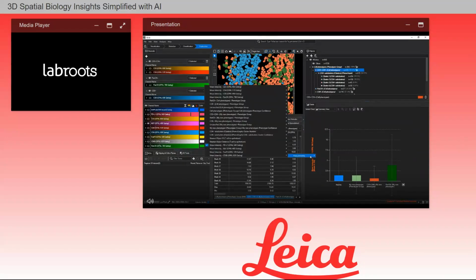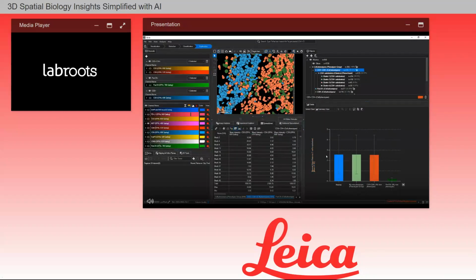We will now go to summary view in charts to look at the CD4 subcluster's relationship to PAN-CK. I am going to plot the mean nearest object distance, then turn off all the other object sets besides the 4 CD4 subclusters. The error bar is quite large on this image, so it doesn't appear that I have anything statistically significant about the difference in mean distance between the CD4 positive cells and the epithelium. Though it would appear that cluster 4 has an ever so slightly smaller nearest object distance.